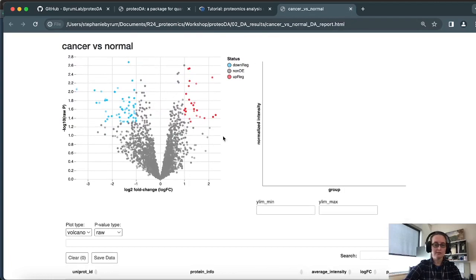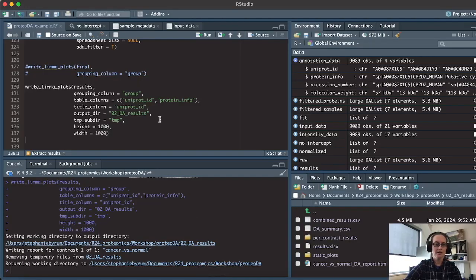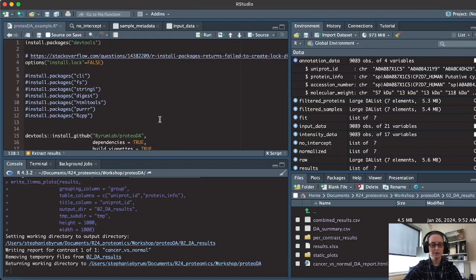So with that, that is the majority of how to run an analysis. If you wanted to go back and rerun the analysis, change the model, add some other groups, change your comparisons, you can easily load it into this ProteoDA package and rerun your analysis. So we really wanted to focus on where the input is downstream of any database search program that you use, because MaxQuant, Spectronaut, they all have different formats that they generate from a database search.